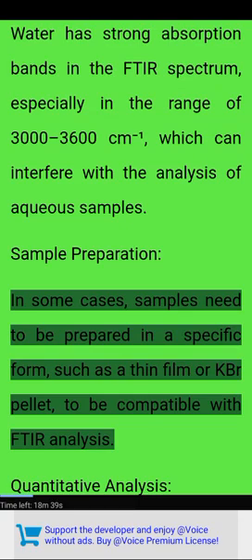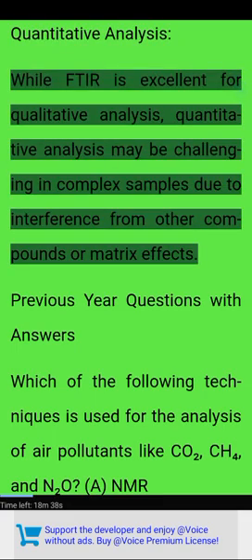Sample preparation. In some cases, samples need to be prepared in a specific form, such as a thin film or KBr pellet, to be compatible with FTIR analysis. Quantitative analysis. While FTIR is excellent for qualitative analysis, quantitative analysis may be challenging in complex samples due to interference from other compounds or matrix effects.